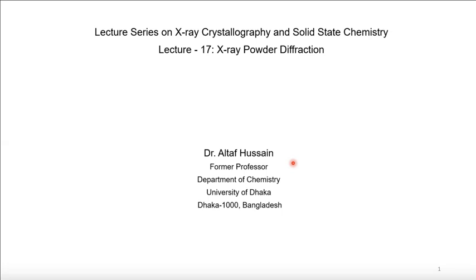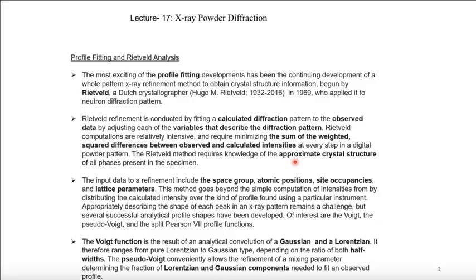In the 16th lecture, we talked about the different techniques, how to collect X-ray powder data, and also the analysis of powder data. There is a lot of information we can get from powder diffraction data about crystalline materials. That's what we talked about. And in this lecture, we'll talk about profile fitting and Rietveld analysis.